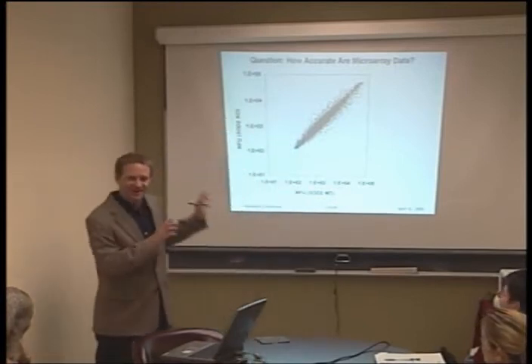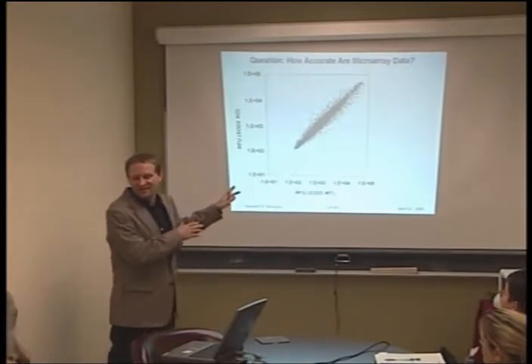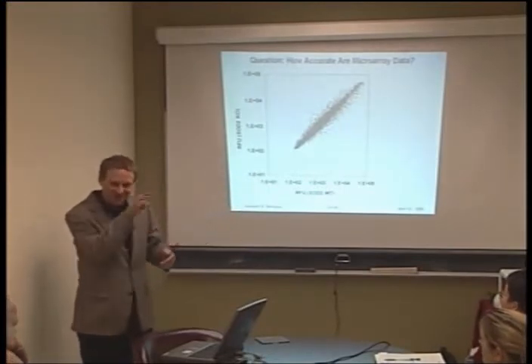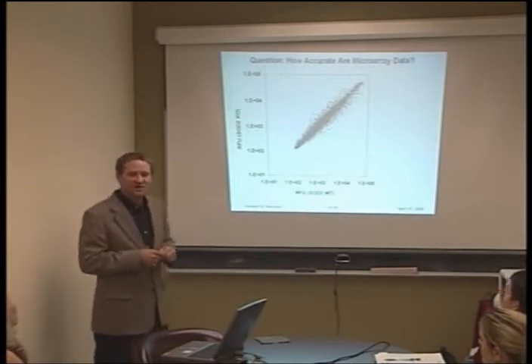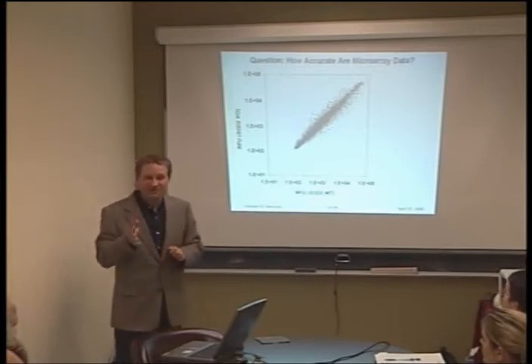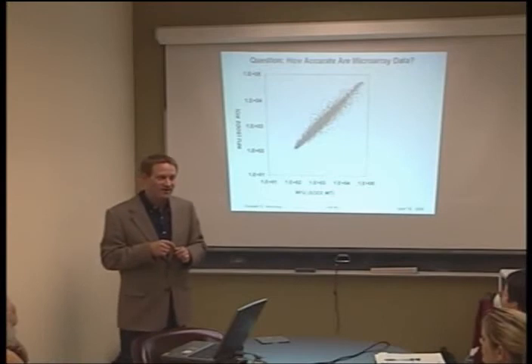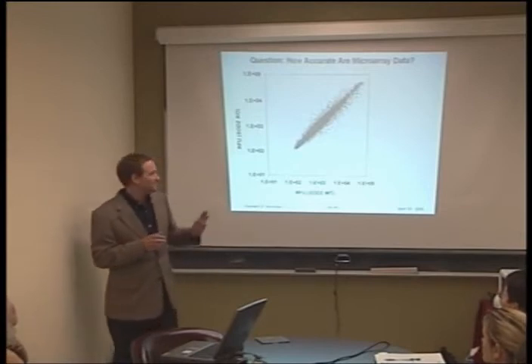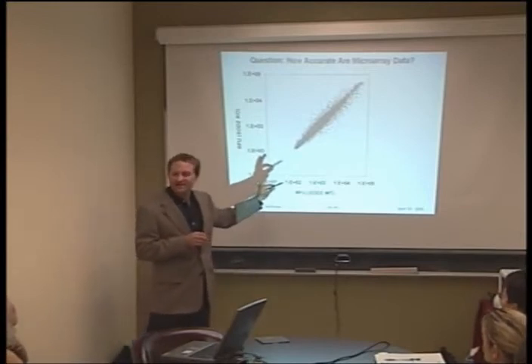A couple of take-home messages here. First of all, you can't look at this kind of information in a traditional way. I mean, you can't print out a list, for instance, of 30,000 genes and just look through it. Also, you have a statistical problem, and this is extremely valid for gene expression and genotyping. You get into a problem of multiple testing, where there's a certain degree of variation in running the assay that's always there.